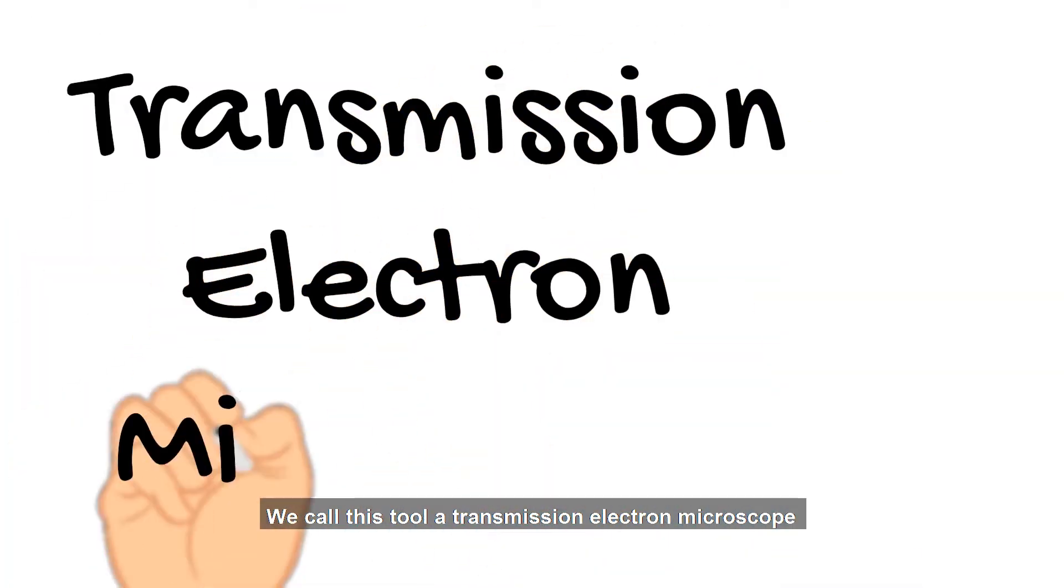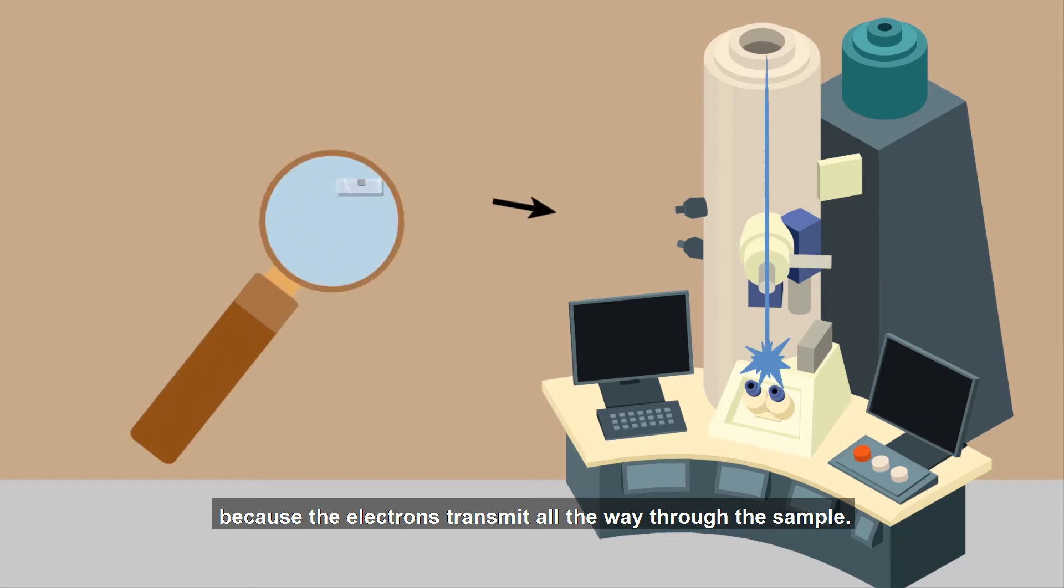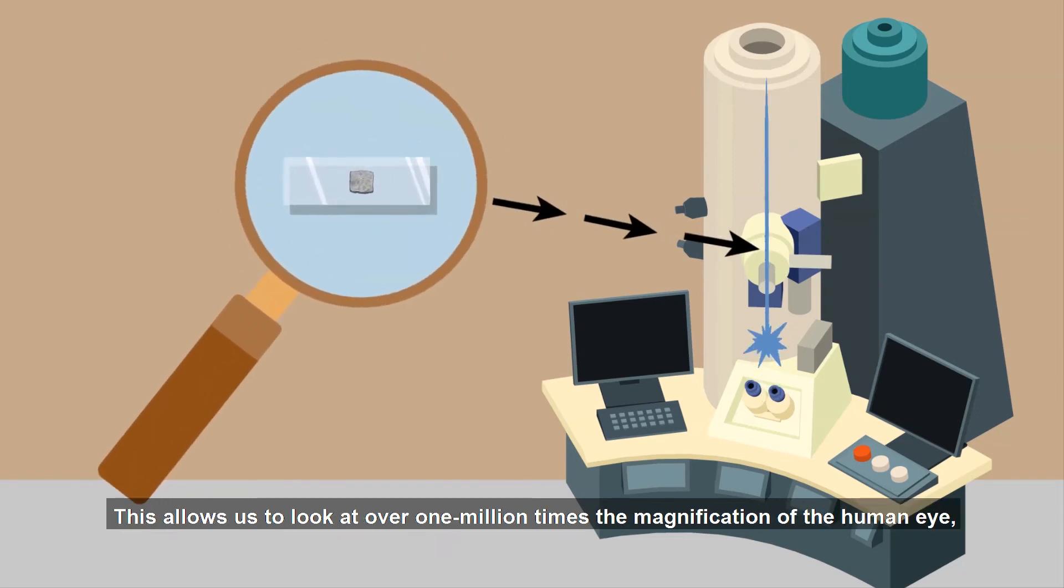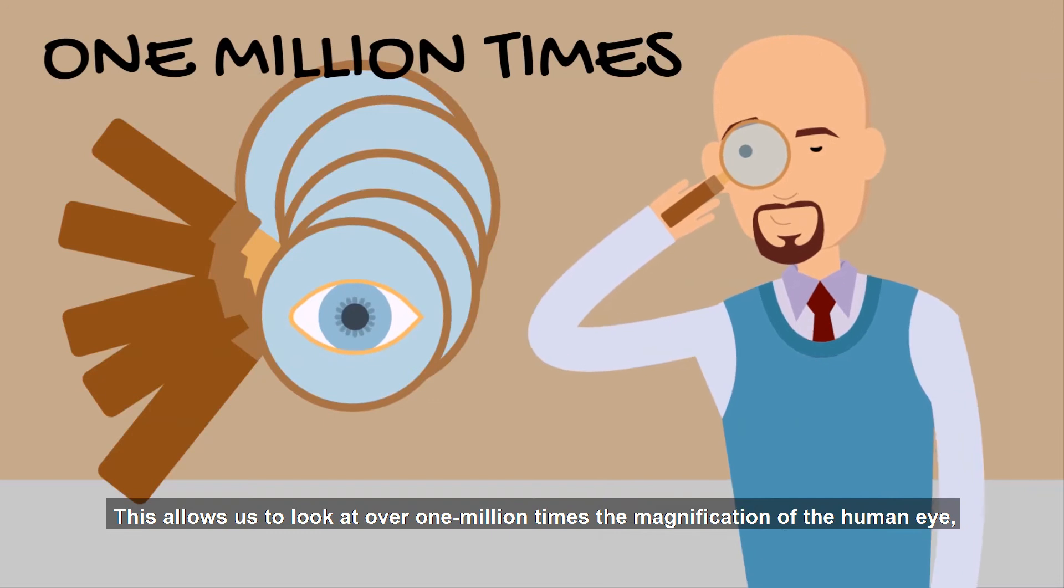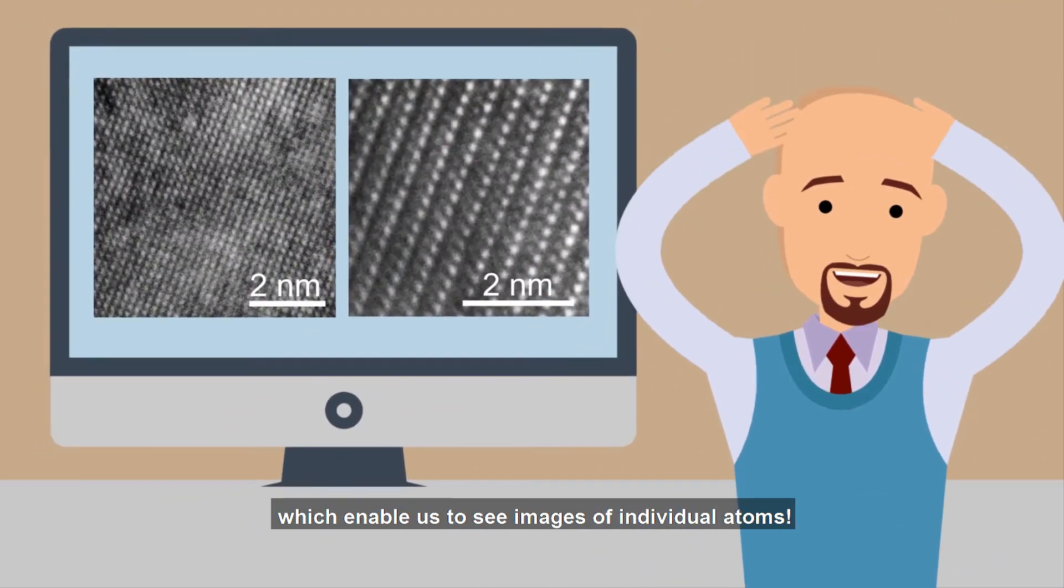We call this tool a transmission electron microscope because the electrons transmit all the way through the sample. This allows us to look at over one million times the magnification of the human eye, which enables us to see images of individual atoms.